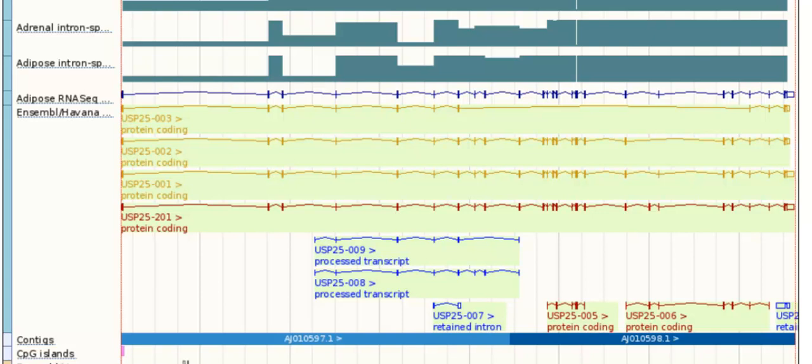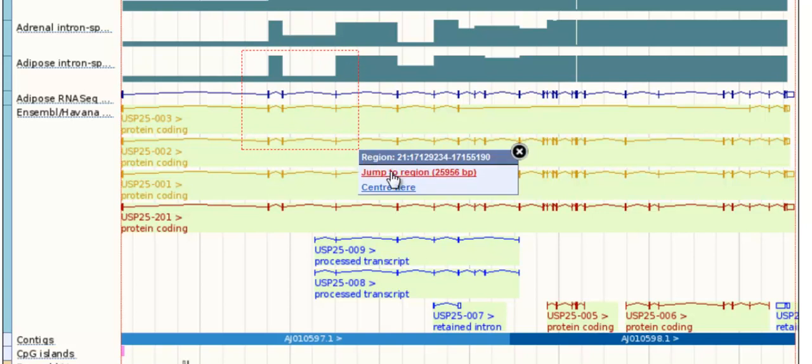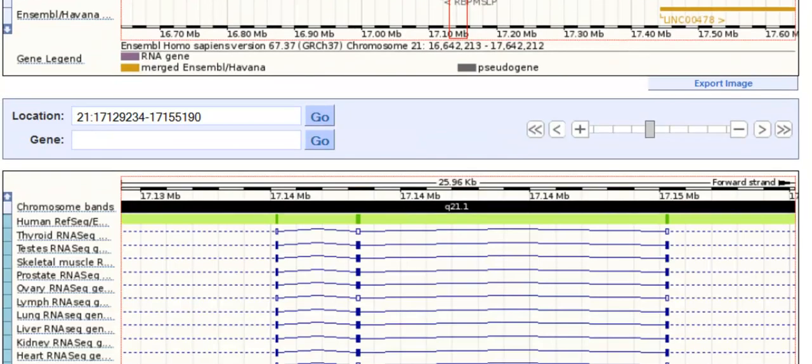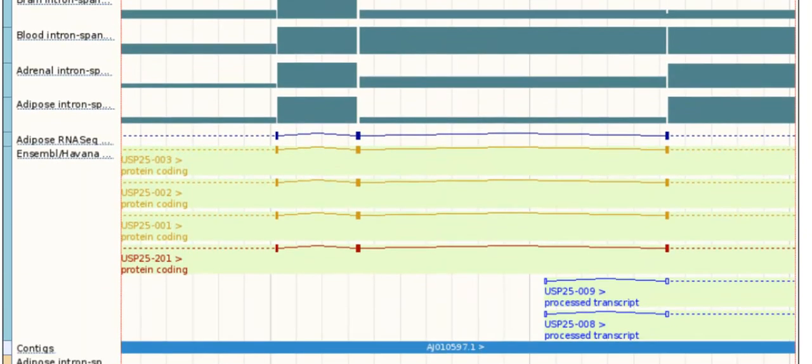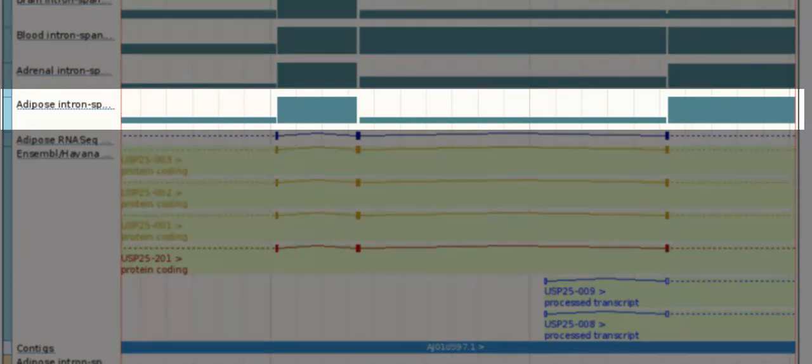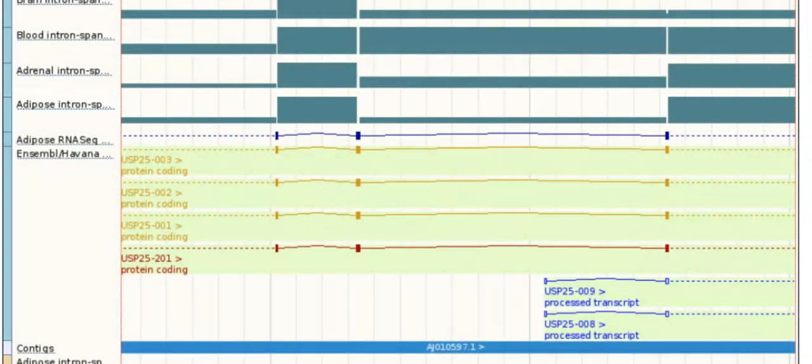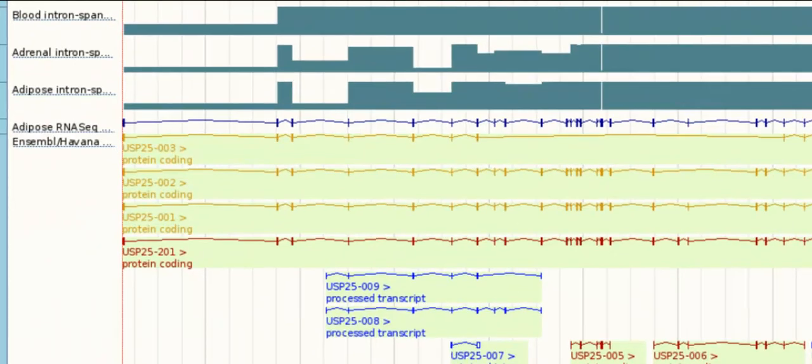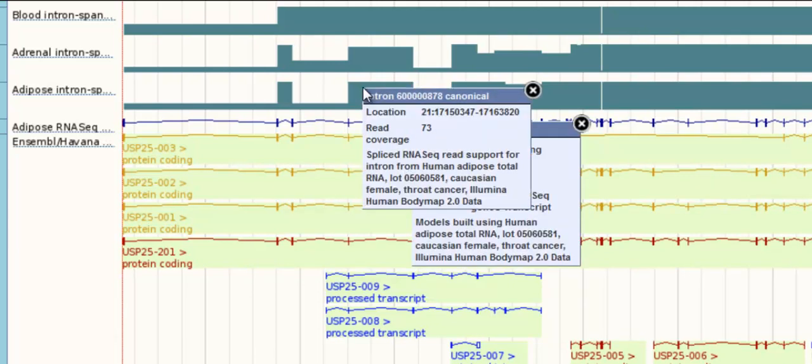Let's zoom in to view the introns in more detail around this region. A deep stack of introns means that a lot of the sequence reads indicate an exon-exon junction at this position. The introns show varying support of the exon-exon junctions. You can click on either the model or the introns in order to find out more information. For example, this intron had 73 reads.